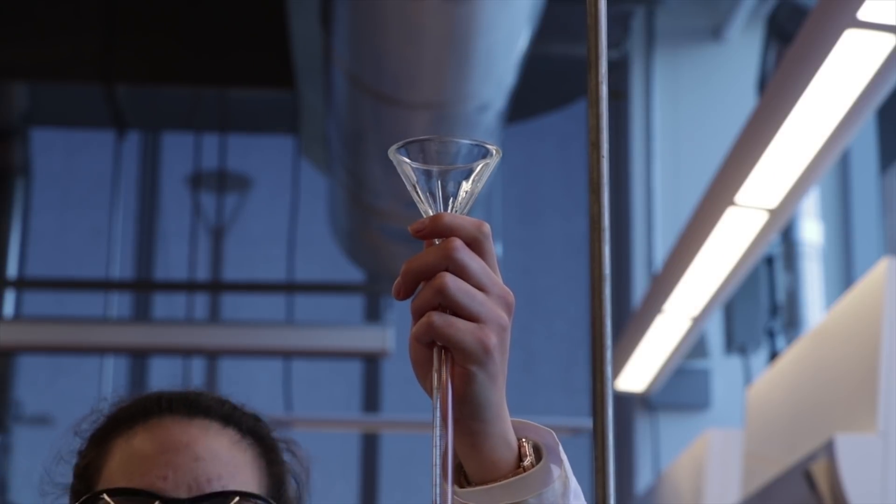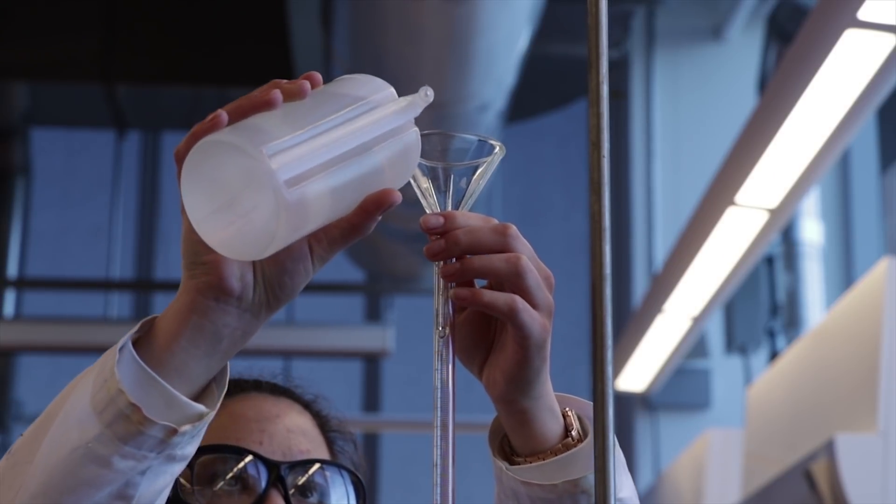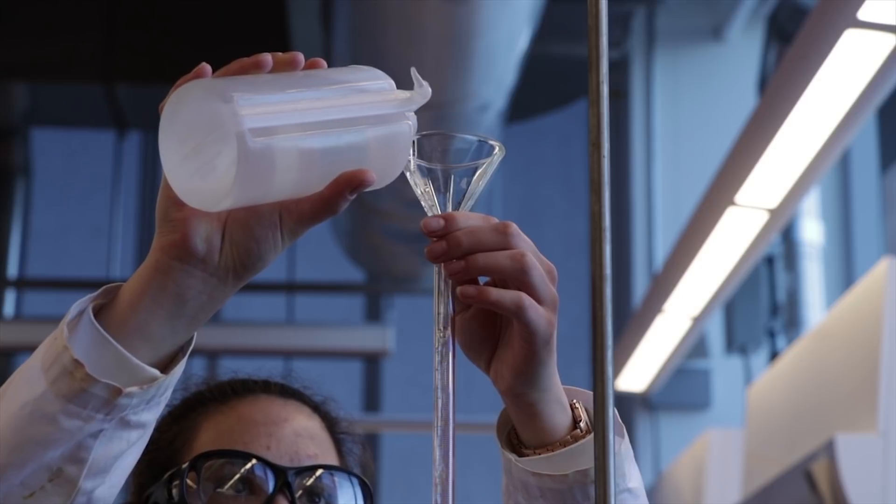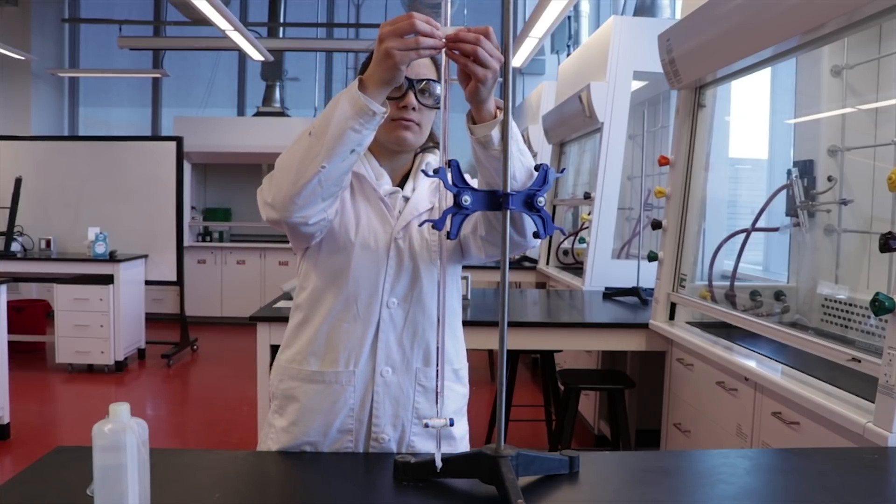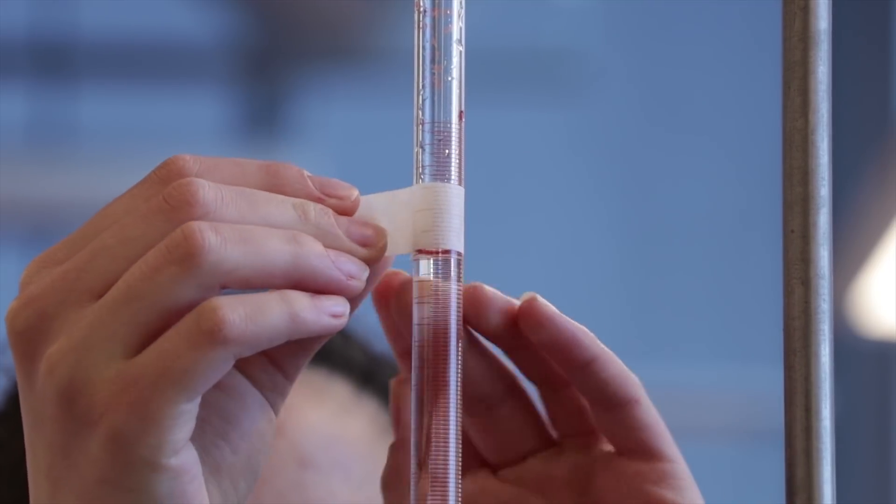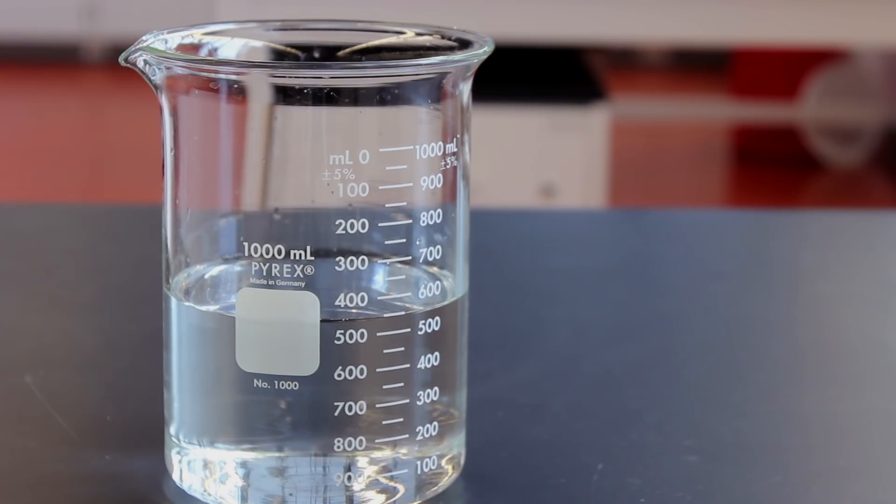Then fill the burette with distilled water using a funnel. Mark the liquid level with a piece of tape. Obtain a 1 liter beaker and fill it about halfway with distilled water.